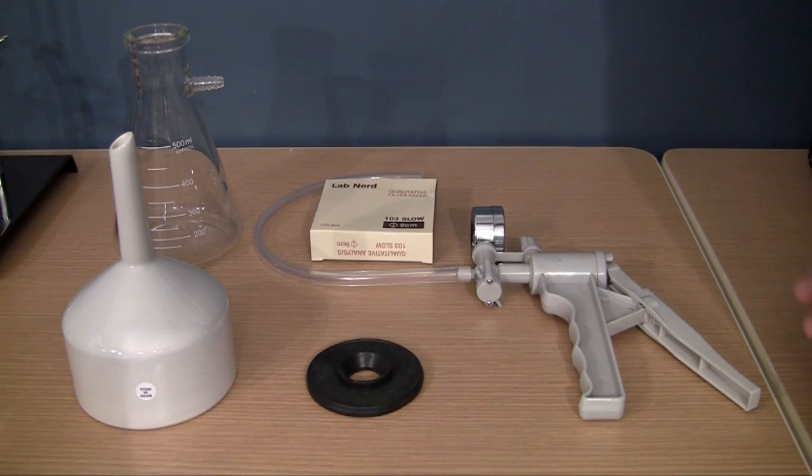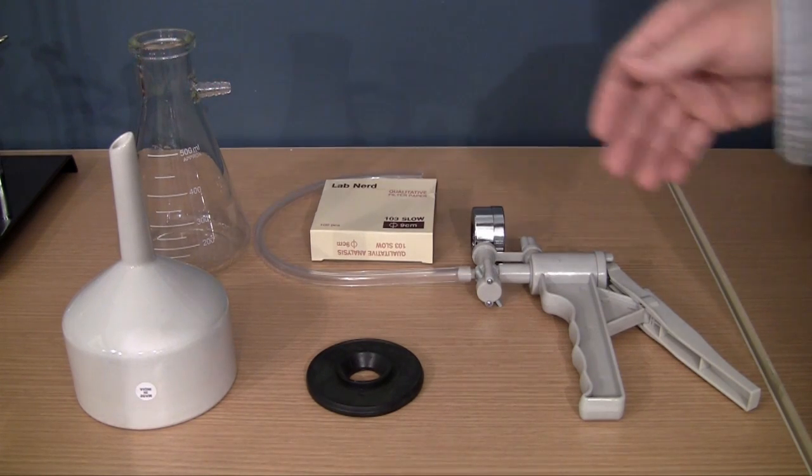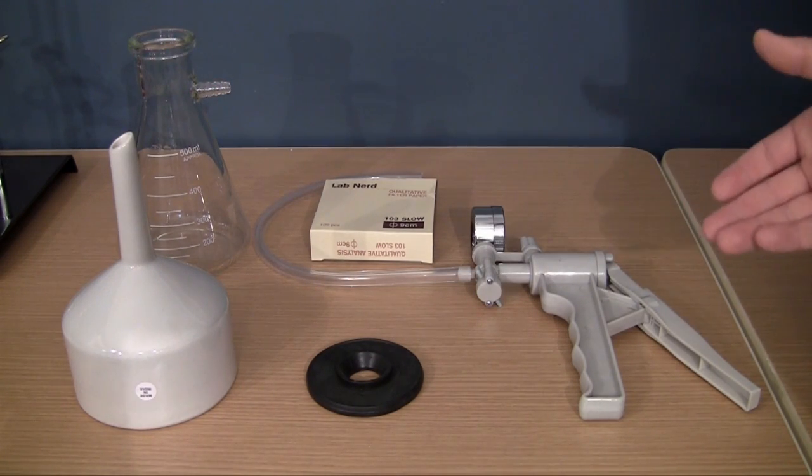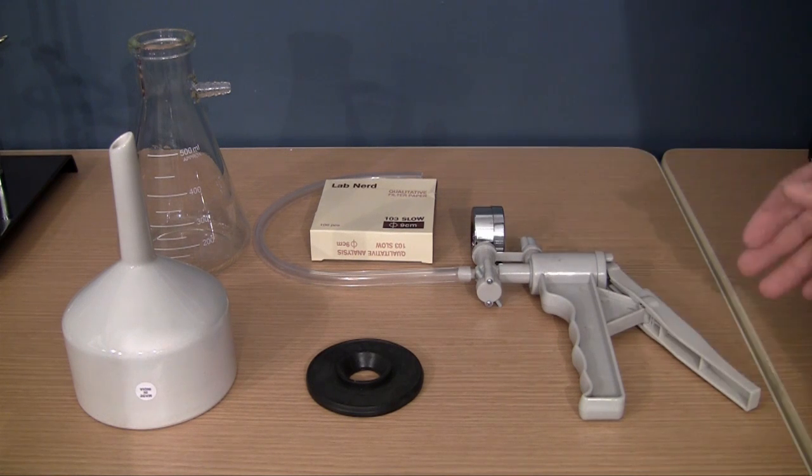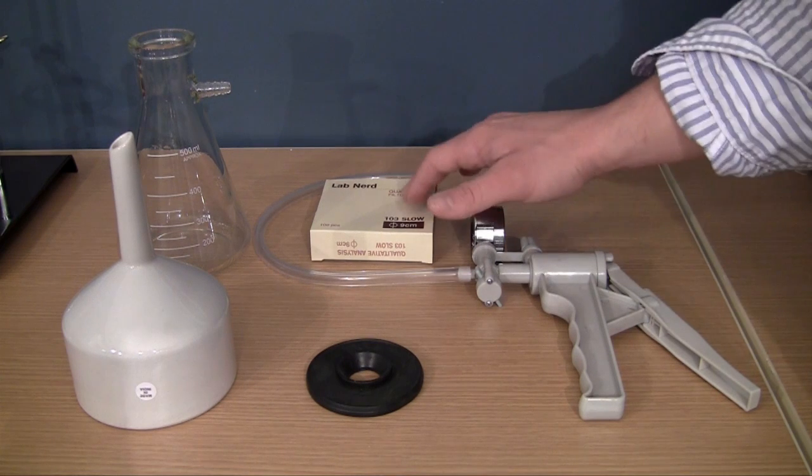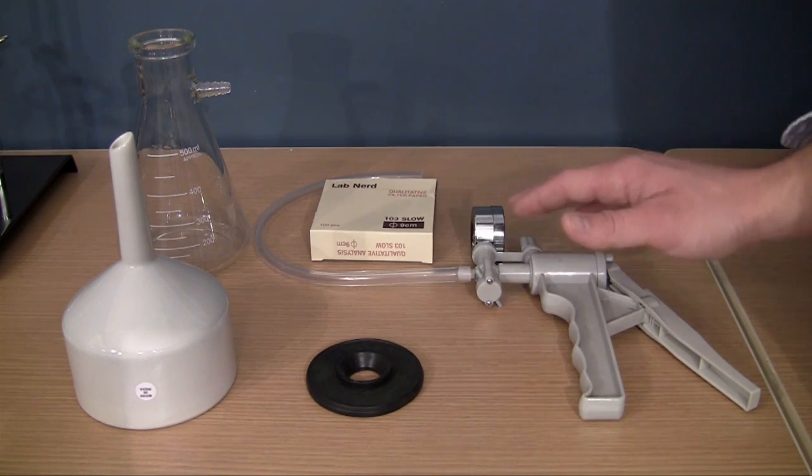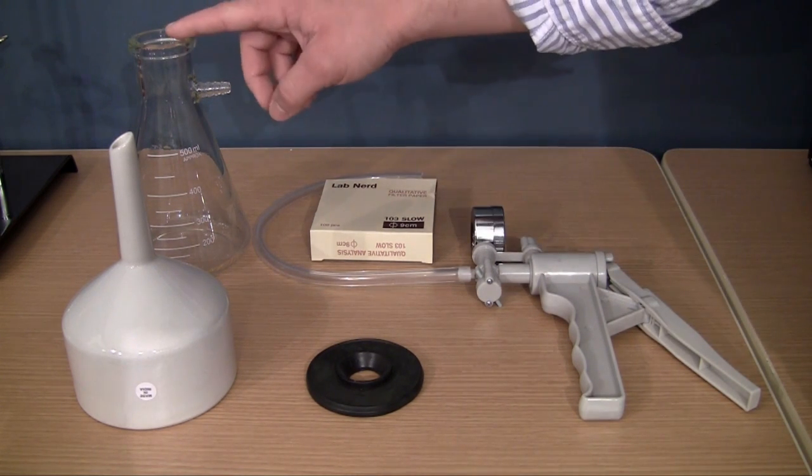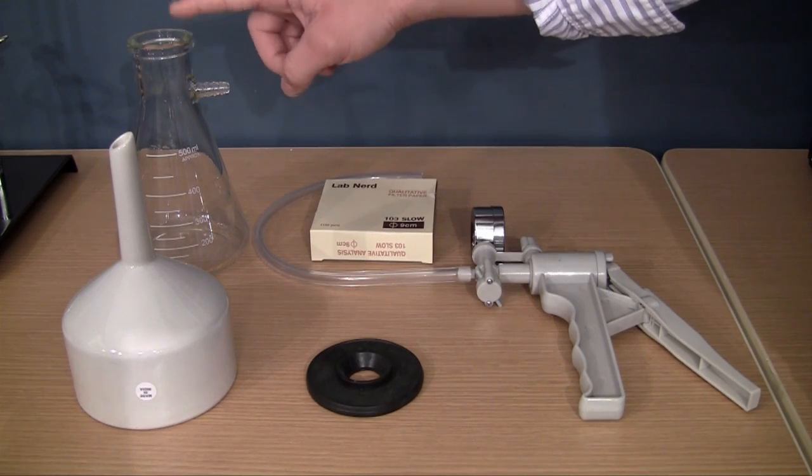Now in order to use a filtering flask right here, you actually need more than just the filtering flask. You need a whole bunch of stuff, and this stuff is actually usually sold in a kit. I got all of these as one kit, including the paper, so let me go ahead and go through the pieces right now. Of course, I already talked to you guys about the filtering flask itself.